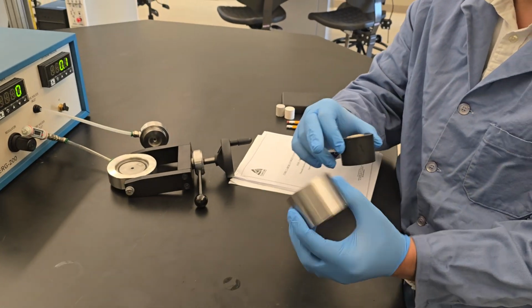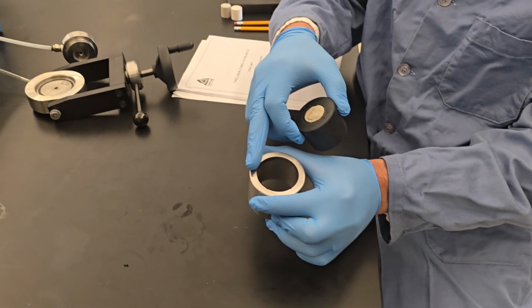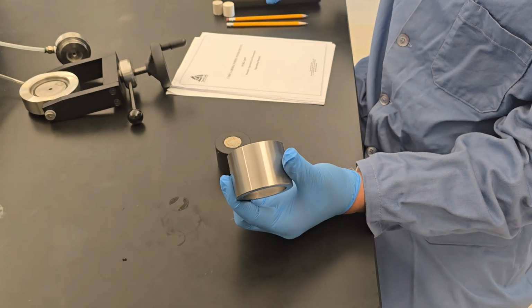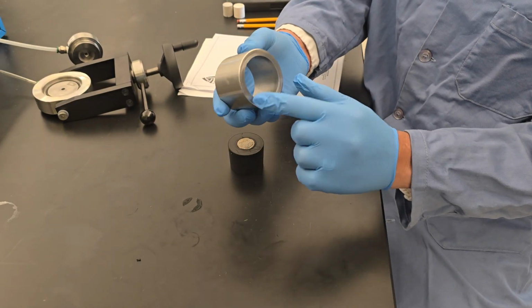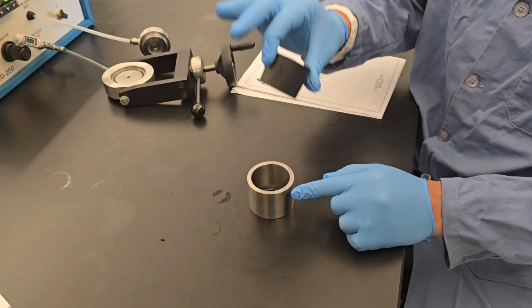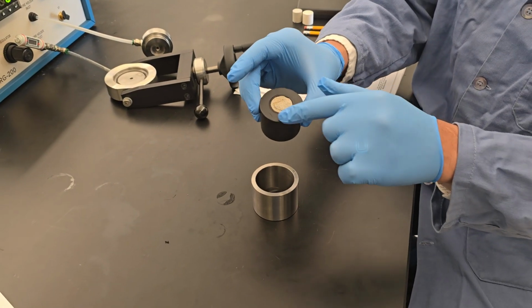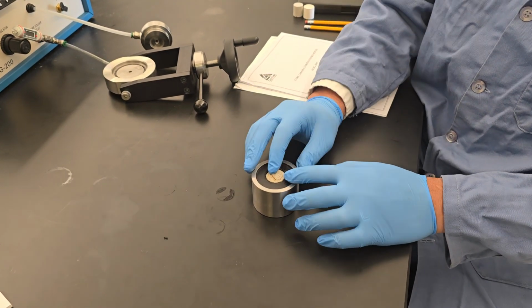So the same thing here, there is one side that has wider metal compared to the other one that has thinner metal. If you're confused, you can use a caliper. If you can't see it with eye, just do it with eye. So we put the wider part down and we get the thinner one up. This will help us to slide this in. And the same thing here, the wider one up and the thinner one down. Once you let it go, easy.